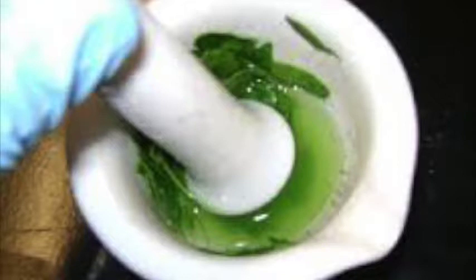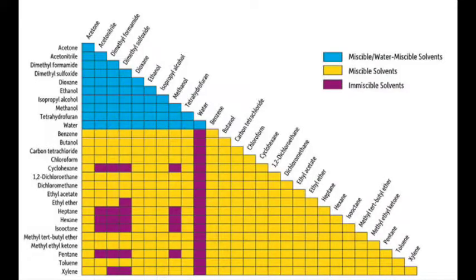If you have a little bit of solid sitting in the bottom, it's going to junk up your whole sample. So you need to very, very carefully decant whenever you're doing this, or a much better idea is to filter it and or centrifuge it. If you want to be careful, do both, and I would do both, especially when you're starting off. Now, if you're dealing with a solution, or a solution that you just extracted a solid with, and you want to try and clean it up some more, then you can do liquid-liquid extraction. So you can use two different solvents to try and push the sample from one into the other.